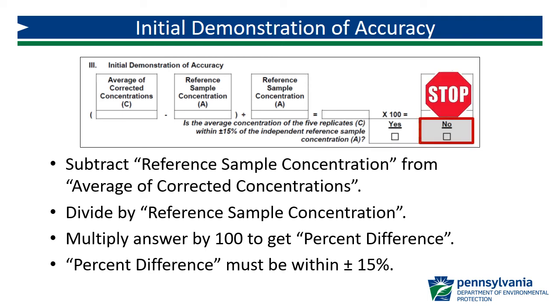If the percent difference is not within plus or minus 15%, the analyst's procedure, reagents, and equipment should be evaluated so the source of error can be determined and addressed. Once any issues have been identified and corrected, the IDC should be repeated.